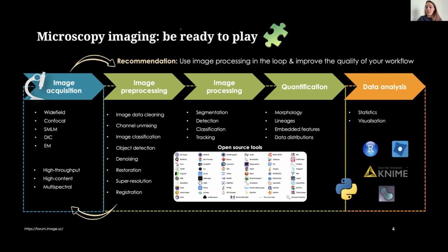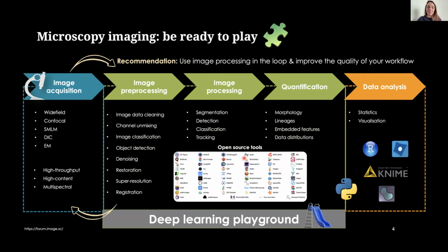And of course, after this, we have the data analysis, right? So this could be an imaging kind of setup. And the exciting part is that all this processing is a deep learning playground. And I would like to highlight that we have many, many open source tools, not only for microscopy, that can be used for each of these steps that I'm showing you here. So this is very cool.